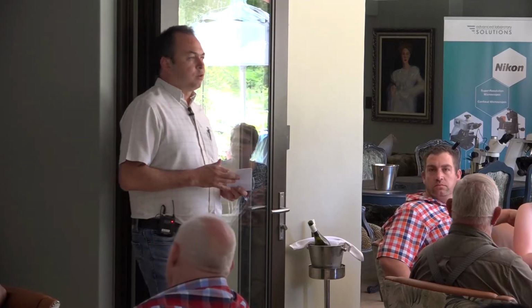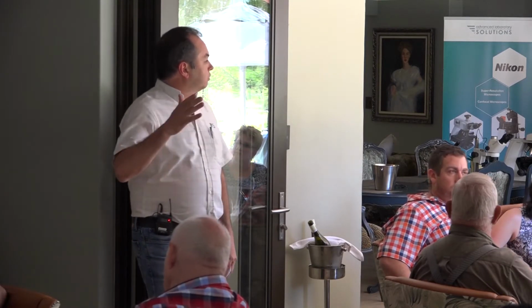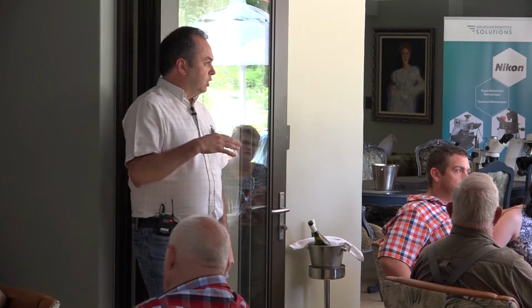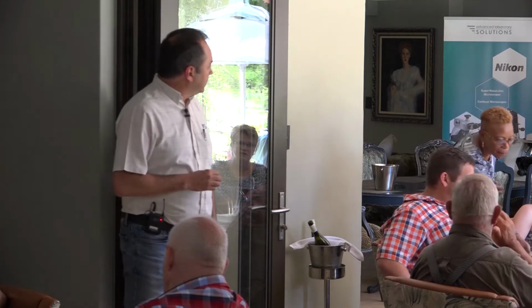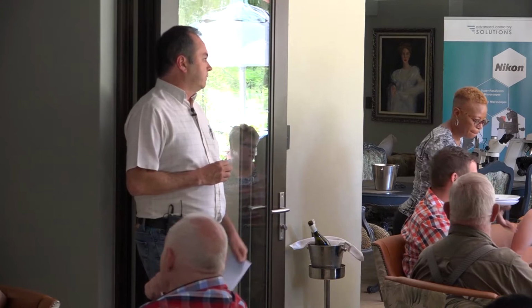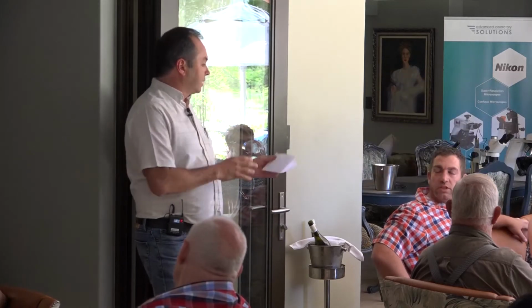What we're going to talk about today is, let's say, the step before that, which is the optical microscopes. So really microscopy is divided into two areas. Your optical microscopy, which is from 1 times magnification up to roughly 1,000 times. And then beyond that, the resolution becomes an issue. You can push it higher than that, but that's really where you get into electron microscopy. And electron microscopy goes from 1 times up to over 1 million times magnification. So we're going to talk about the optical microscopes.